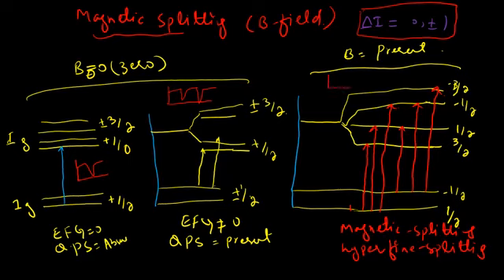But when the magnetic field is present and the electric field gradient is not equal to 0, we have a spectrum with six signals. So the spectrum will be like this one. This is the corresponding Mossbauer spectrum for magnetic splitting. This is the Mossbauer spectrum for quadrupole splitting, and this one is for electric field gradient equal to 0, in the absence of quadrupole splitting.